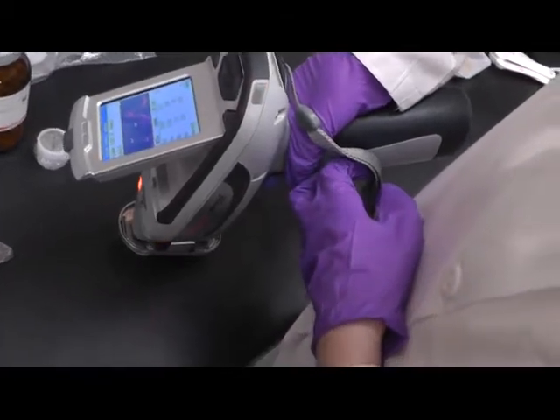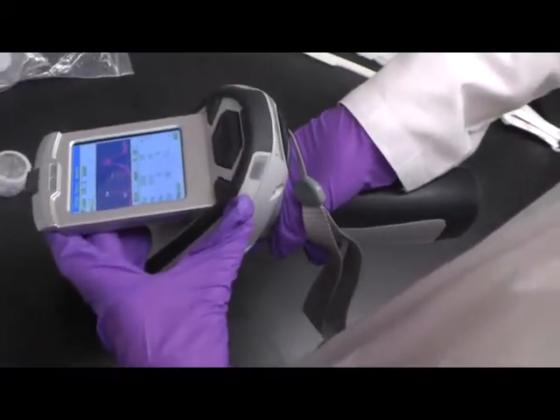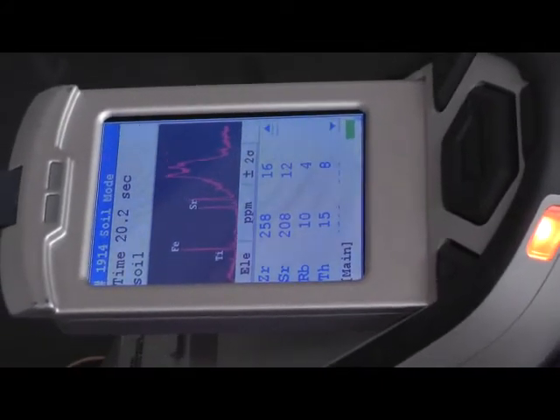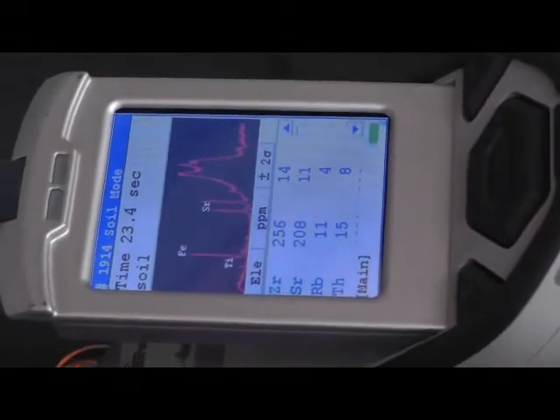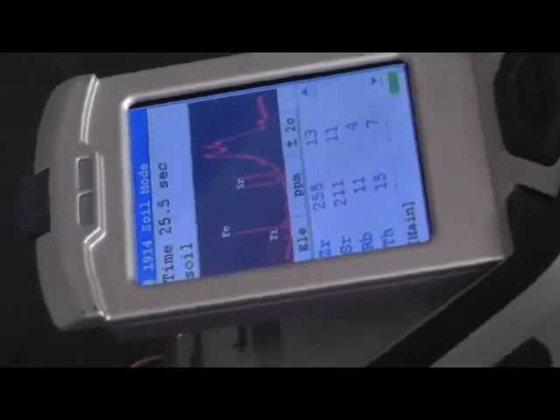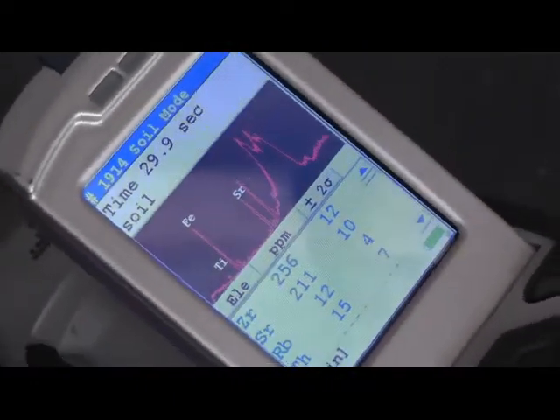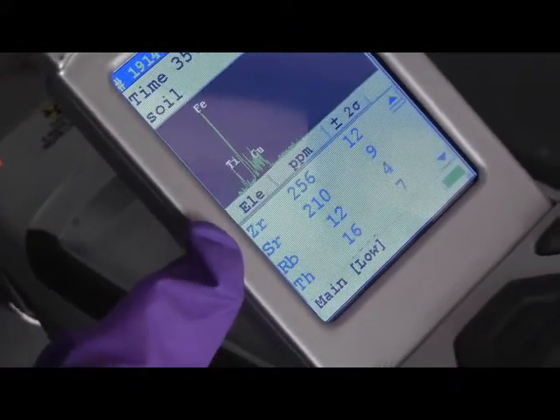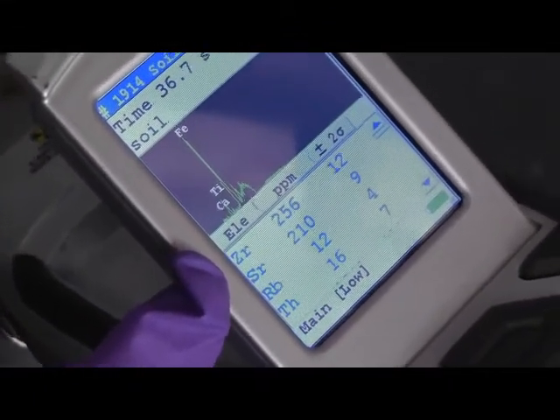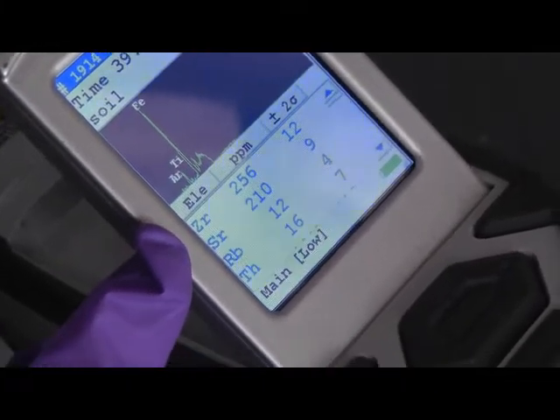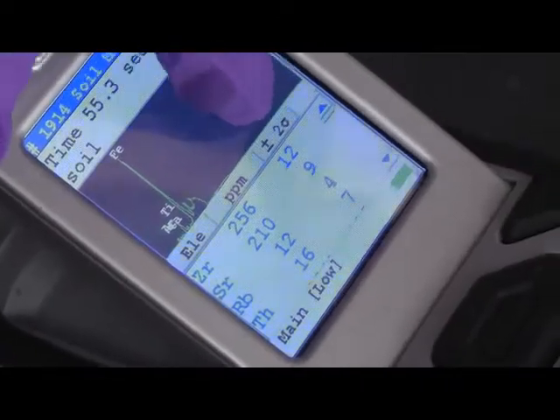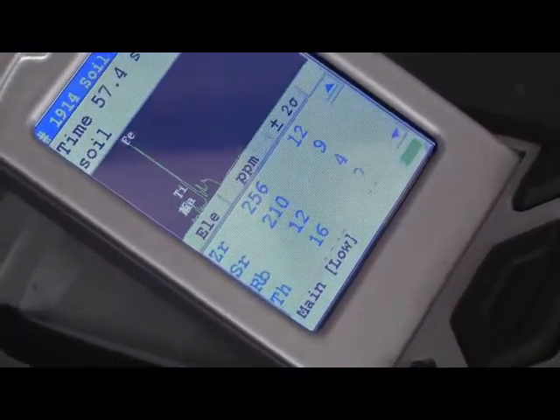And on the screen, you can see that there are already measurements, preliminary measurements coming as time goes on. And in the soil mode, it's going to give you three information. Elements, which is the elements XRF is measuring right now. And there's the unit ppm. The last column is the error measurement.